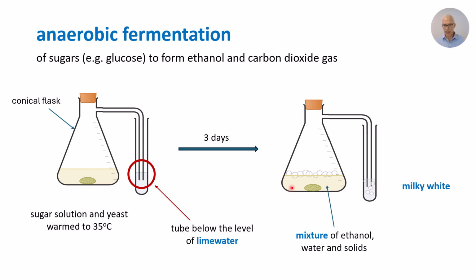We've got remaining in the conical flask a mixture. That mixture should contain ethanol, but it will also have water and the solids from yeast.